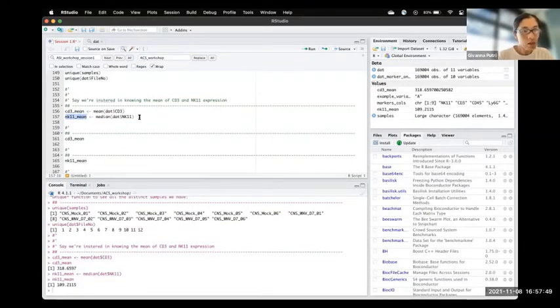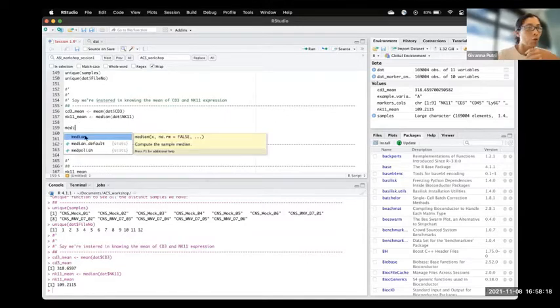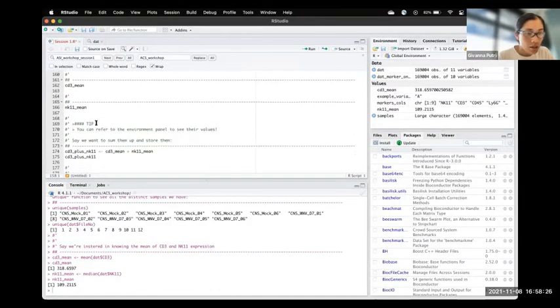Like that. As you notice, as I'm typing things like, say I want to see standard deviation, SD, I think, like that, sometimes this kind of pop-up will show up and it will try to help you understand what the parameters are, what you need to supply. I found it quite handy. Also sometimes as you're typing a function name, it should try to auto-complete it for you, give you some sort of suggestion, that I thought might be quite useful as well. So yeah, that is that one.